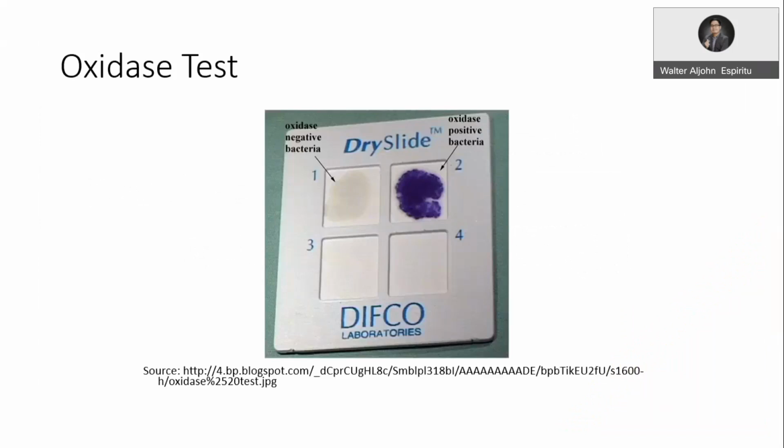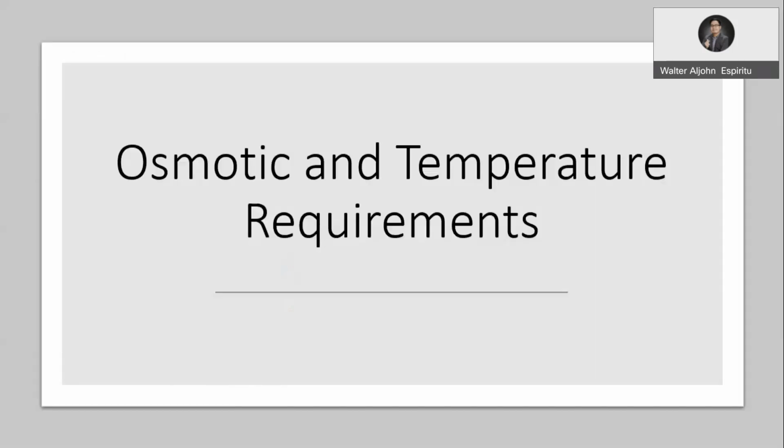Again, we don't have this particular reagent. So for the oxygen requirements, the only thing that you can perform is the catalase test. Next, for the osmotic and temperature requirements.